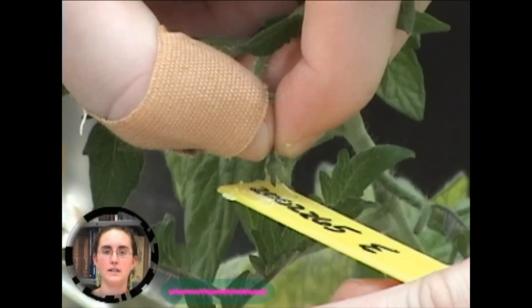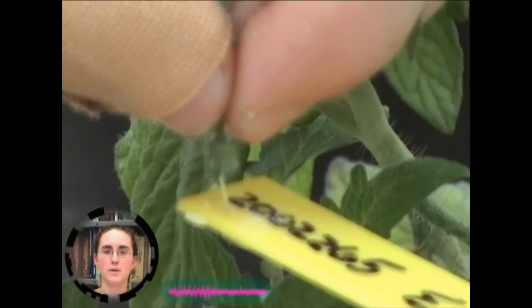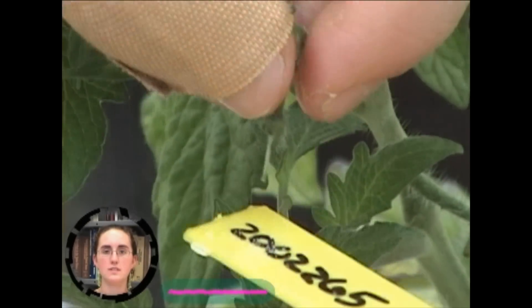The pollinated flowers on the female plant are then labeled with tags to differentiate between fruit resulting from the cross and fruit from self-pollination.